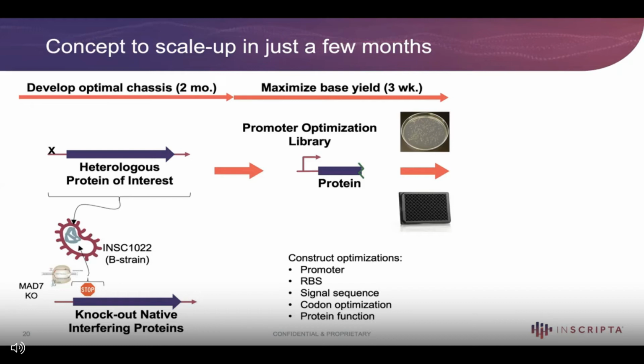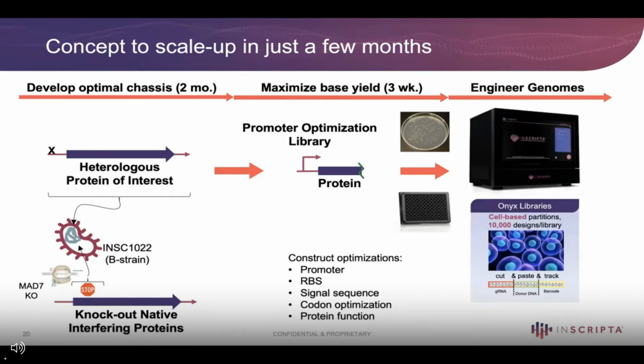And once it's installed within the genome, you get to explore all of the protein function that comes with that mutagenesis. Then the real fun starts as soon as you have that base strain. Then you get to cycle through and engineer genomes to be able to track the edits, and that uses, again, that barcoded capacity of being able to make variants.